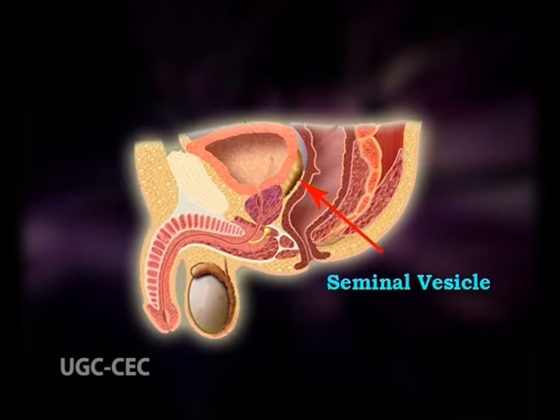They are elongated sacs about 4 cm long and 2 cm wide which taper where they unite with the vas deferens. Each seminal vesicle consists of one coiling tube about 15 cm long. All the lumina visible in a section of the seminal vesicle are in continuity in the intact organ.